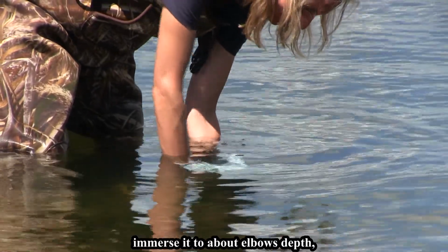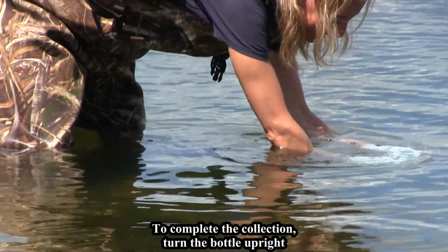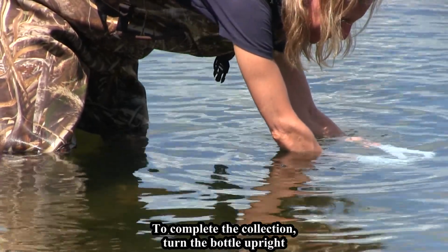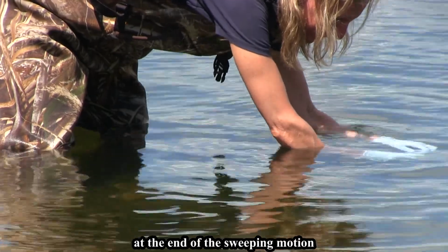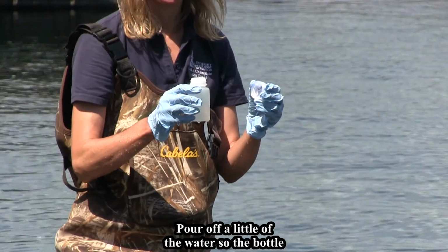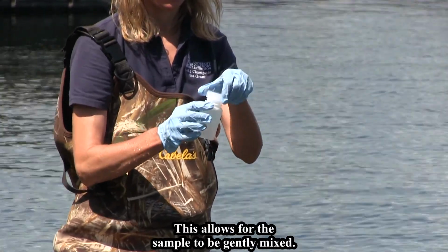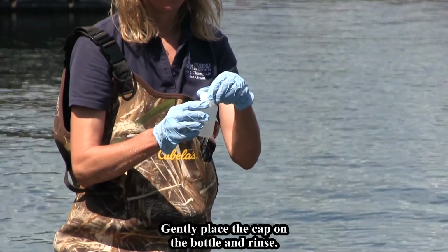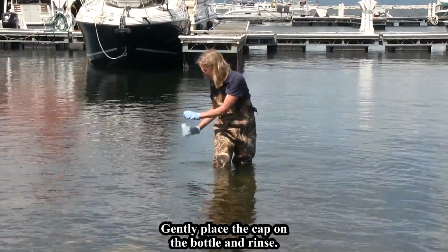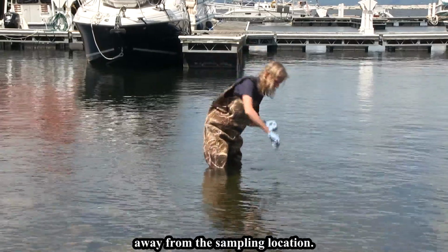Immerse it to about elbows depth and move it in a sweeping motion away from you. To complete the collection, turn the bottle upright at the end of the sweeping motion and bring it up out of the water swiftly. Pour off a little of the water so the bottle is filled only to the shoulder. This allows for the sample to be gently mixed. Gently place the cap on the bottle and rinse. Pour the sample out behind you, away from the sampling location.